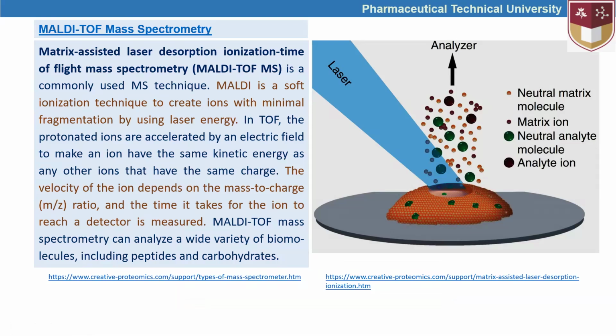This may not be a true hybrid because matrix-assisted laser desorption ionization is a type of ionization method, and TOF is a mass analyzer. As we talked about in our lesson, a neutral matrix is mixed with the analyte and subjected to laser treatment.